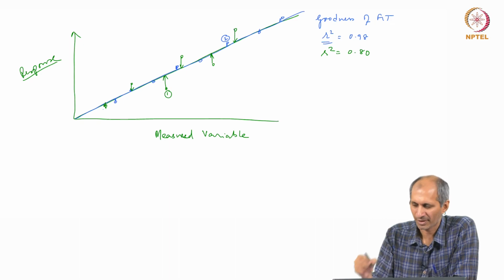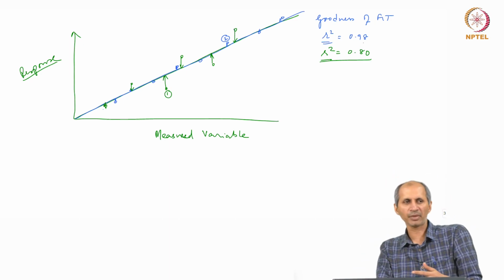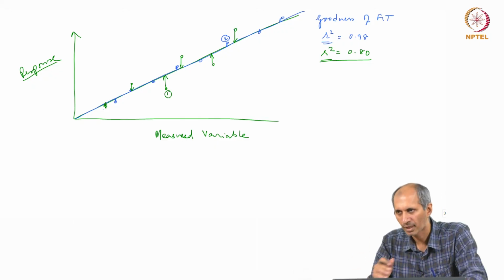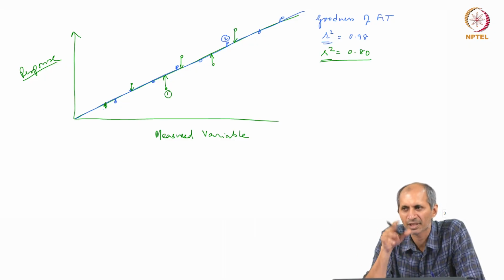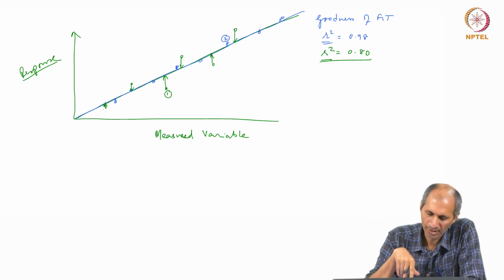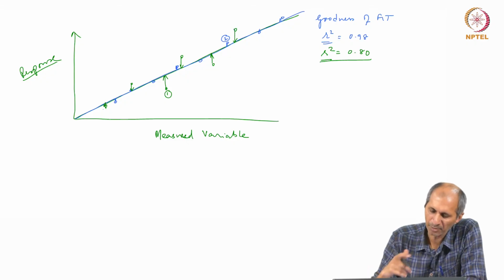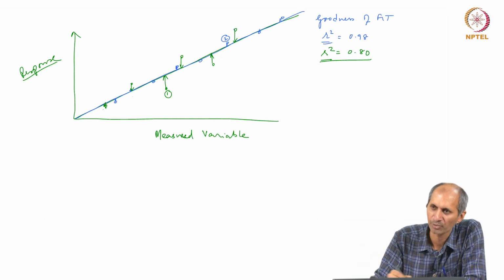When we do this kind of analysis, if the distance between your fit and your experimental data becomes larger, then you have less confidence in that data. There are uncertainties creeping in. I am not sure which of these data points is incorrect, so that will change my actual value a little bit. In general, people try to keep the calibration curve as tight as possible. We would like to keep it like the blue points.